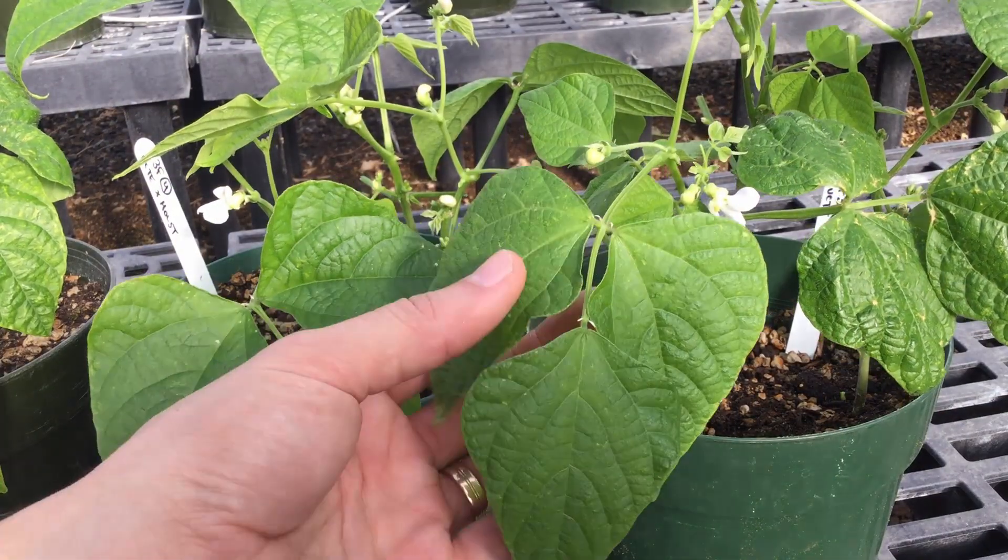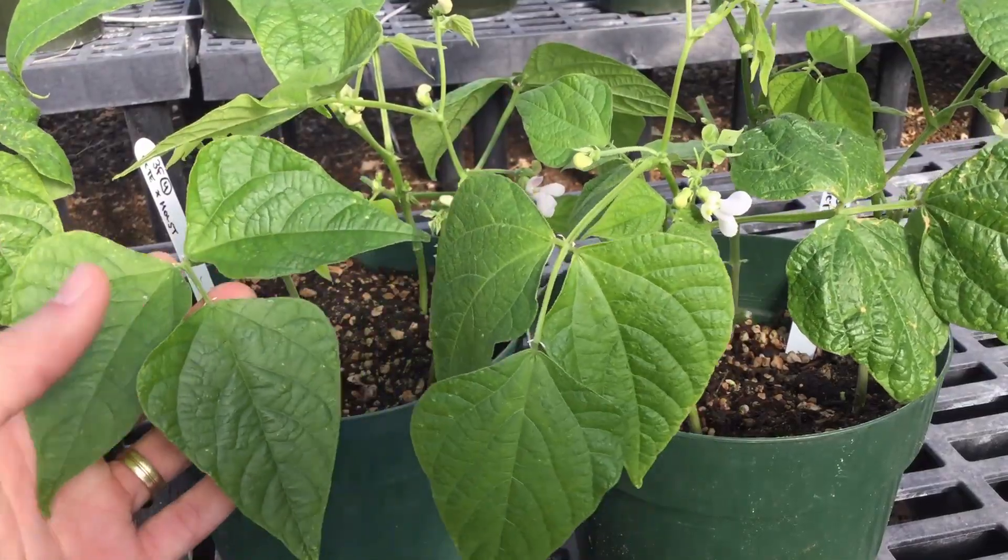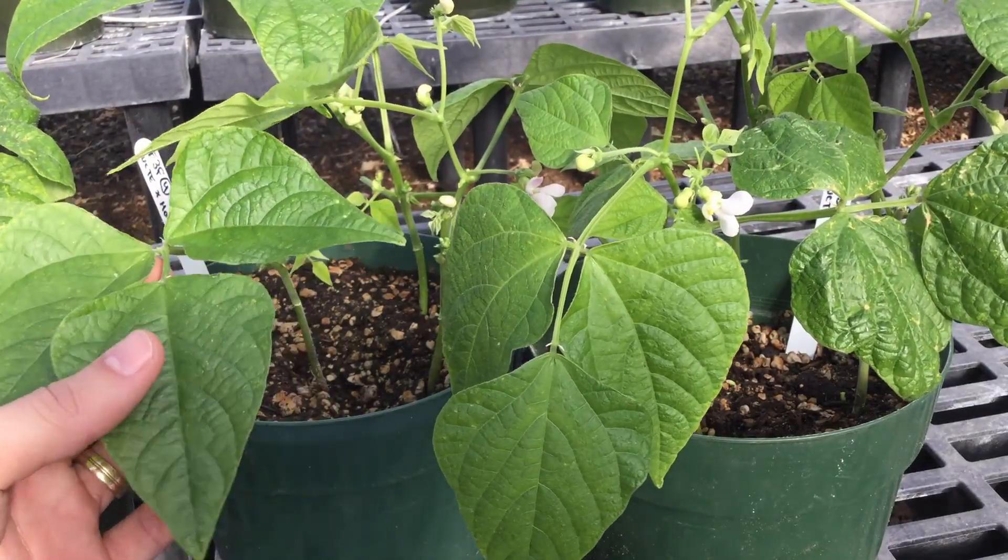Today we're going to talk about how to make cross pollinations in the genus Phaseolus, which includes most of your dry beans and green beans.